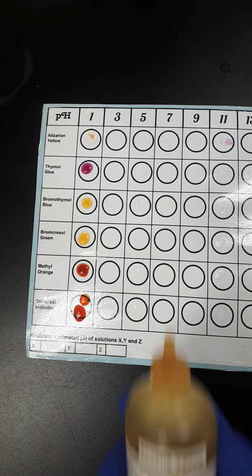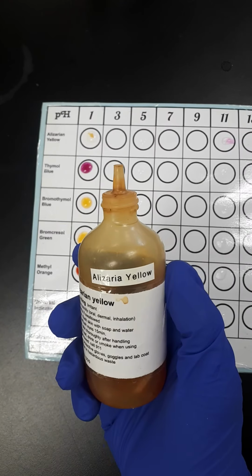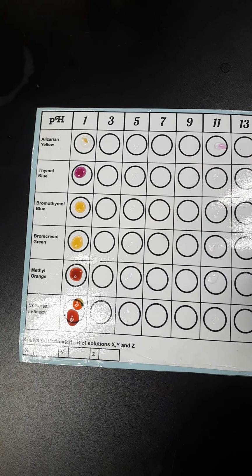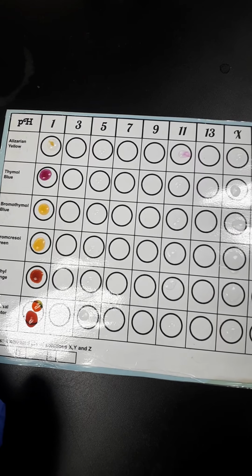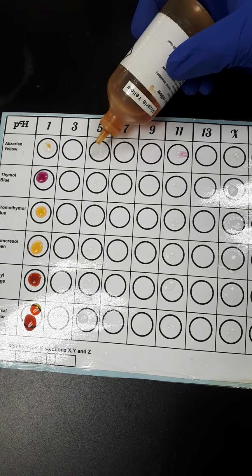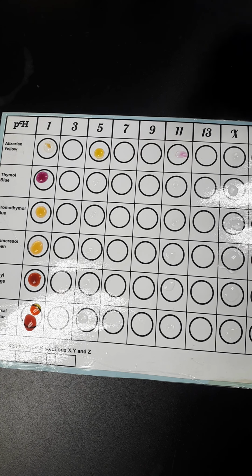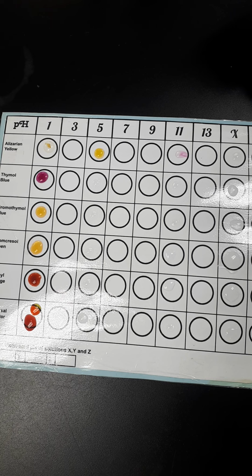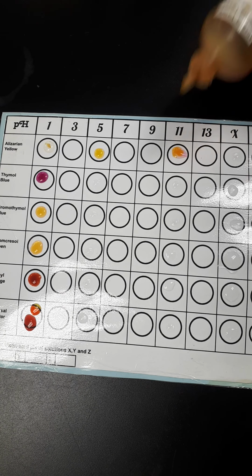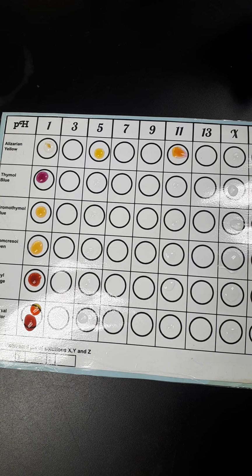So as we go through, check out alizarin yellow, and maybe what we'll do is we'll just kind of finish off the alizarin yellow. So pH of 5, I think I can get it right there that we can see everything. So what color would this be in a pH of 5? Hopefully you're still seeing yellow. Very, very good. Alizarin yellow. What about a pH of 11? What do you think? Alizarin yellow, pH of 11, more of an orange color now, right? Because it's right in between that pH range.